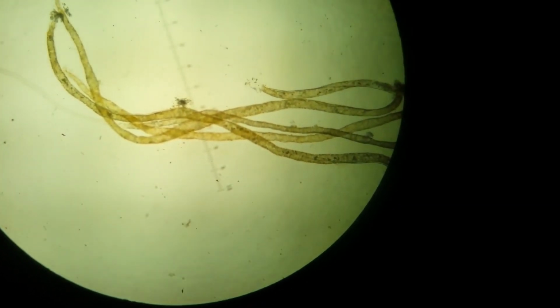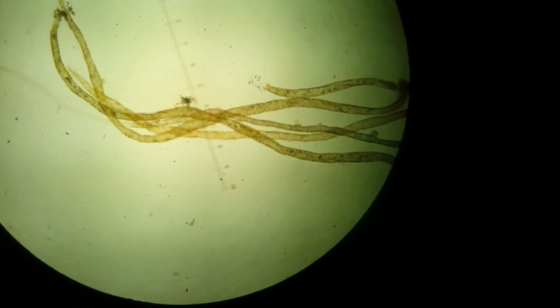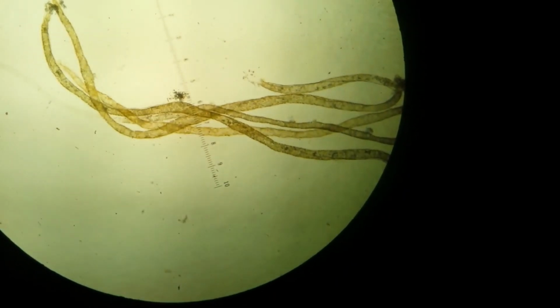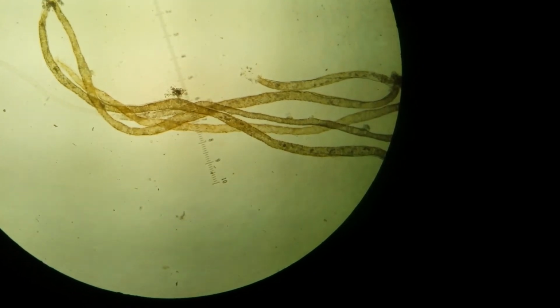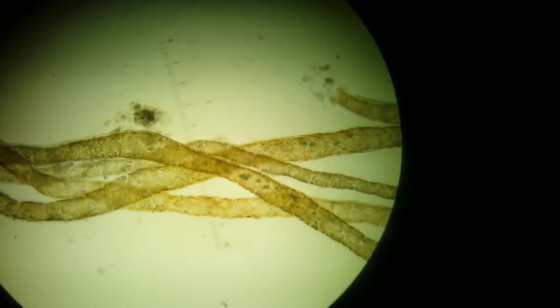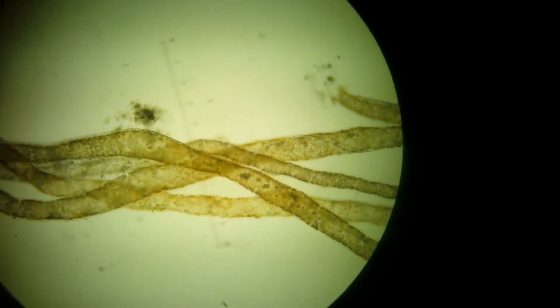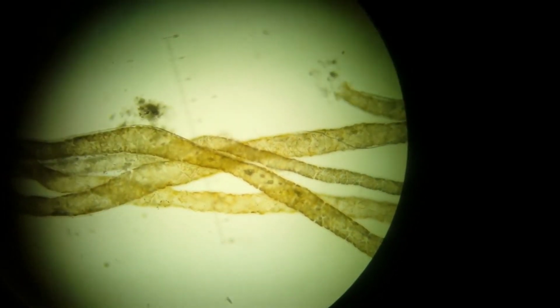So you can see active solute secretion happening. Amazing. Again, a really awesome view of substances traveling through the Malpighian tubules here. So we're just dissected out of a cricket.